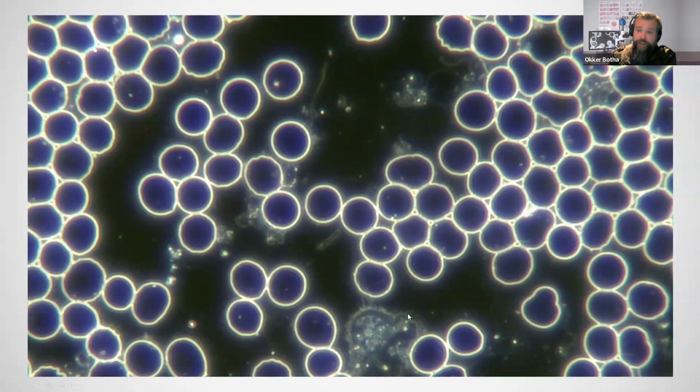At the bottom, we have a monocyte here, a white blood cell with some strands coming off it as well. So, all these patterns are the things that actually make a live blood analysis session important. These are the things that we look for.